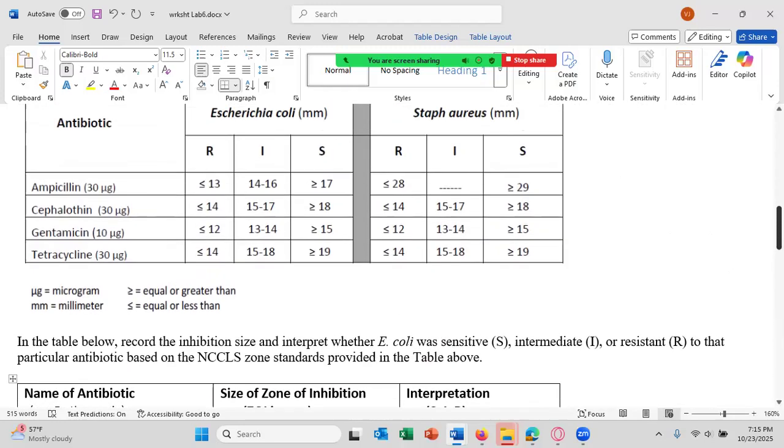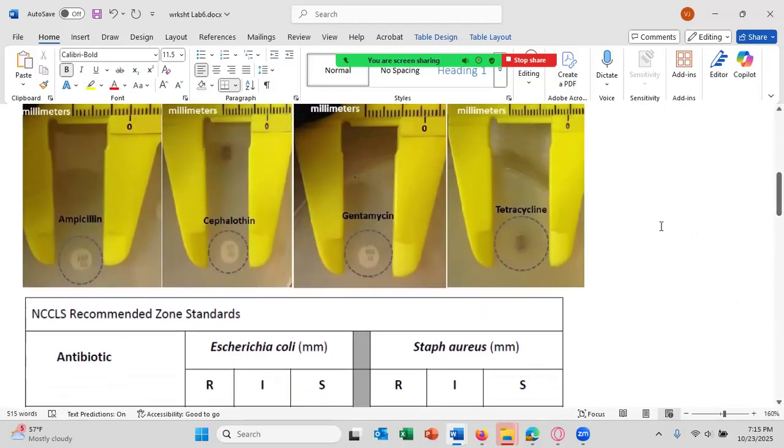So here, we have a certain concentration, which I can almost read. It's probably 30, meaning 30 units of ampicillin are in the disc, if I'm reading that correctly. I might not be. Somebody might have better eyes than me, and you can read that. So what would happen if we put more antibiotic in the disc? And then what would happen if we put less antibiotic in the disc? So tell me in the question.